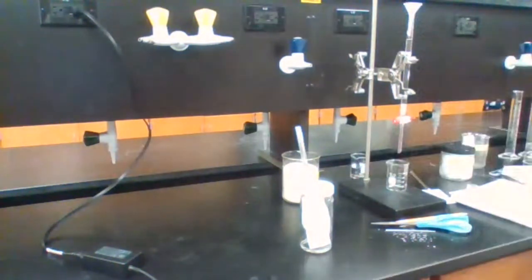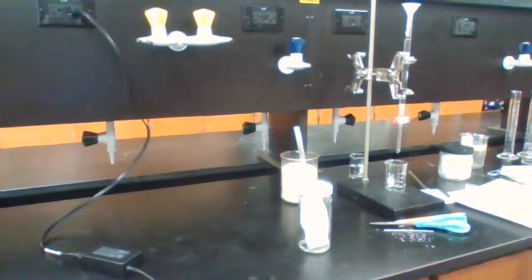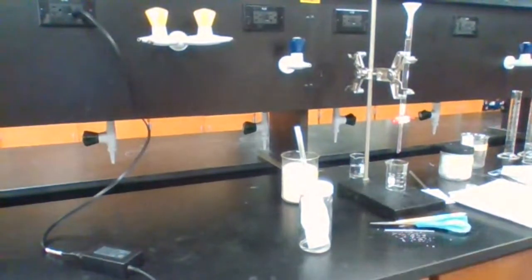So I have my hexane, monitoring this at the same time. Then we add our adsorbent, which is alumina.